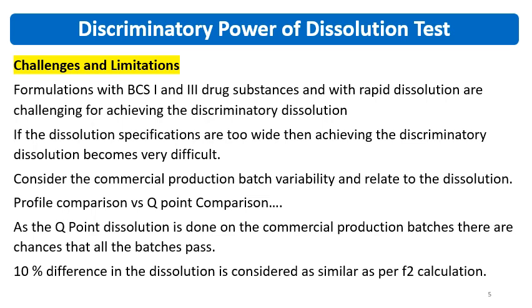But you should always consider only the commercial production variability. If your manufacturing process is wet granulation and you take a batch with direct compression and then show the discrimination, it is wrong and it should not be a practice, because in production you are not going to make a batch with direct compression.